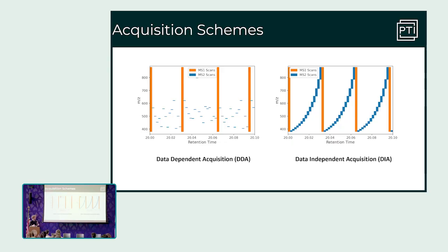But because we have multiple peptides in a single spectrum, it's not simple to disentangle which fragments came from which. So in the examples that were shown previously, it was a DDA spectrum where all the fragments are assumed to come from a single peptide. What happens, and how do we search data when that is not the case?